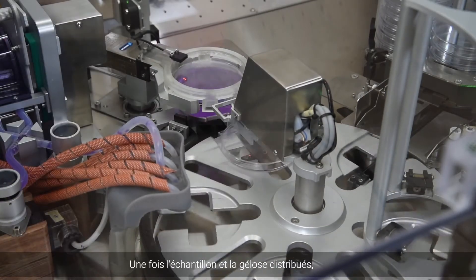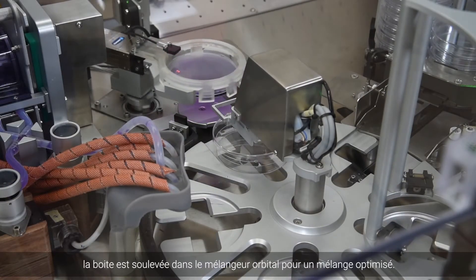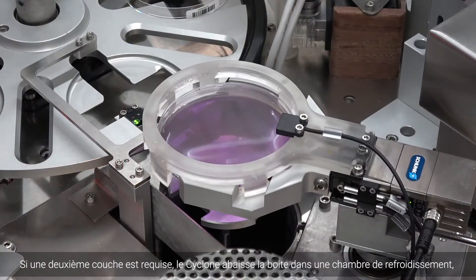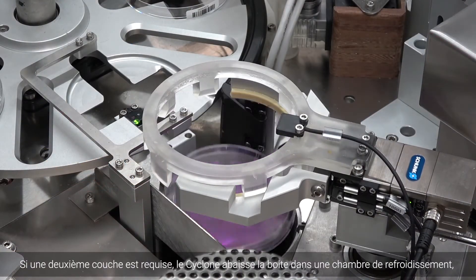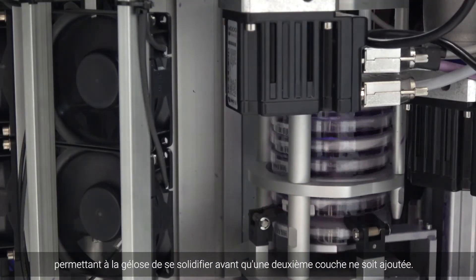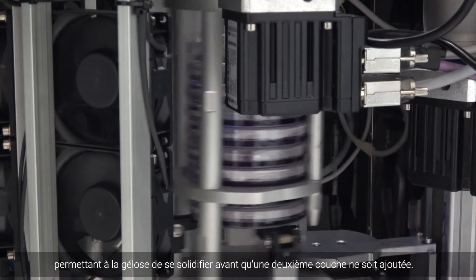After sample and agar are dispensed, the plate is lifted into the orbital mixer and gently homogenized. If a second layer agar overlay is required, the Cyclone lowers the plate into a cooling chamber, allowing the agar to set before a second layer is applied.